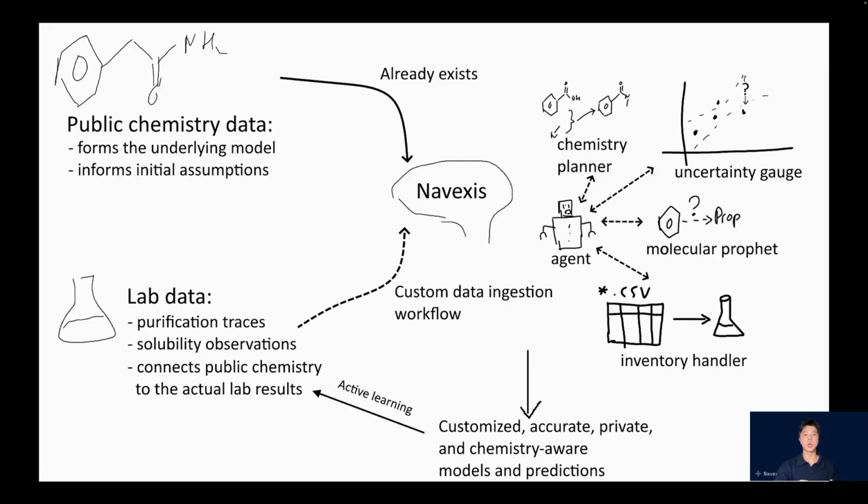The scientist will set the priorities: what features to optimize, what value to target, what scaffold to preserve. The agent will call on a number of tools, including synthesis planning, uncertainty-aware models, which predict how much new information each compound can generate, and of course, the base predictive tool.